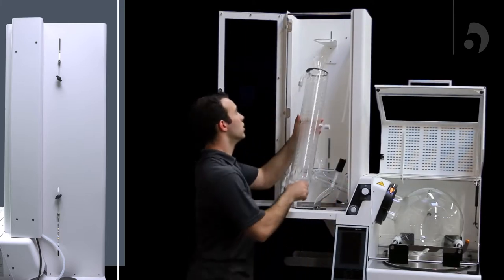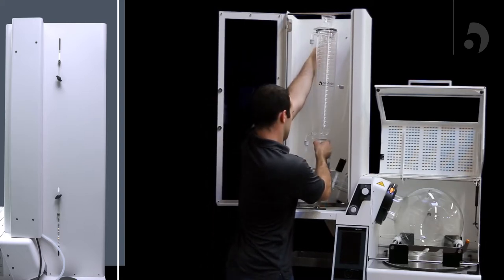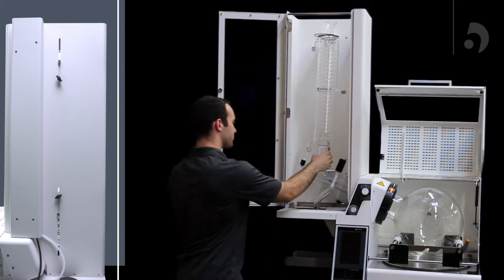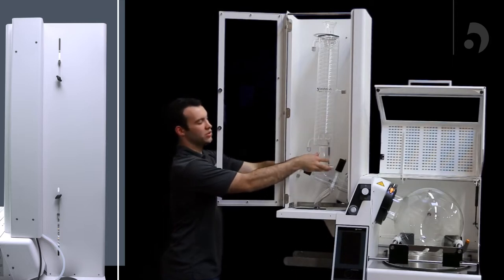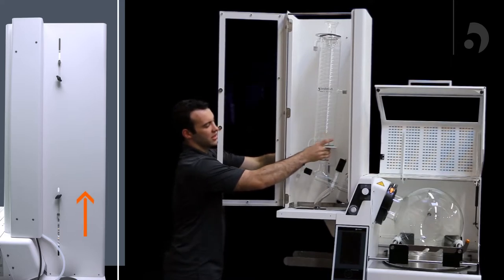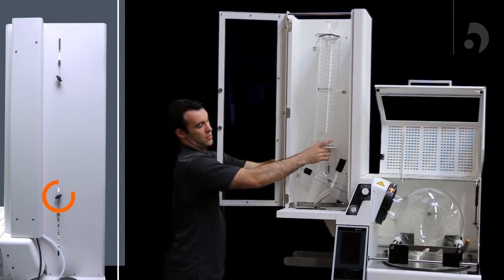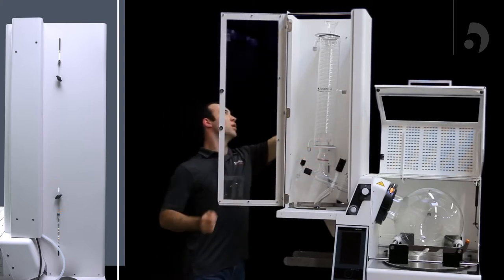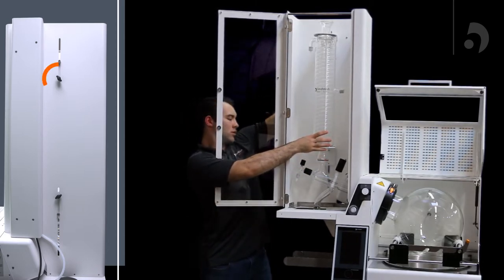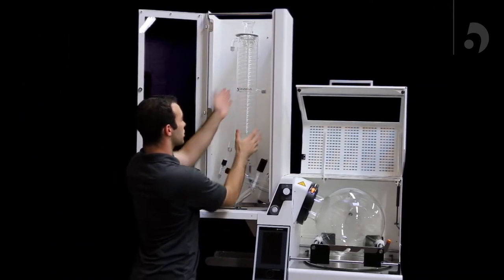Now we can slide it into the bottom of the top support, raise it, and let it drop as we set our condenser into our distributor. Tighten the condenser support, and then you can do the same with the top support. Once you've tightened those, you can make any minor adjustments to make sure it's straight.